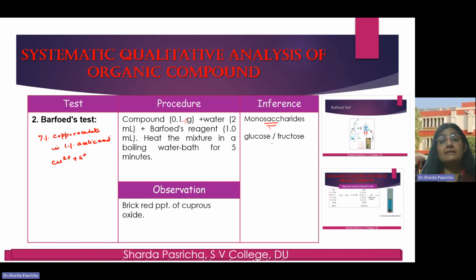What happens is this, as I said, is a test which distinguishes the monosaccharides from the disaccharides. The monosaccharides, being more reactive than the disaccharides, are oxidized by cupric ions in the acidic medium.